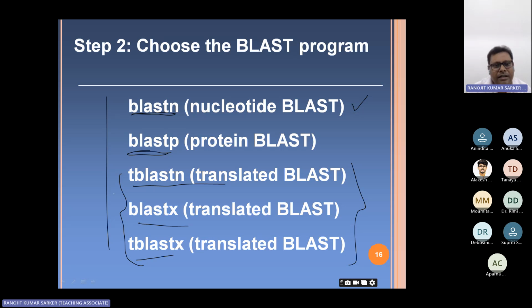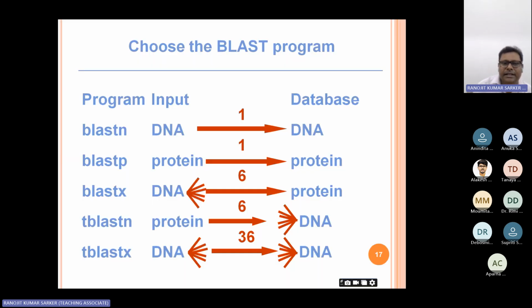Mainly, translated BLAST is used for research purposes. Now let's see how they actually work. Then we will understand which translated version I need to use, when, and how they function.